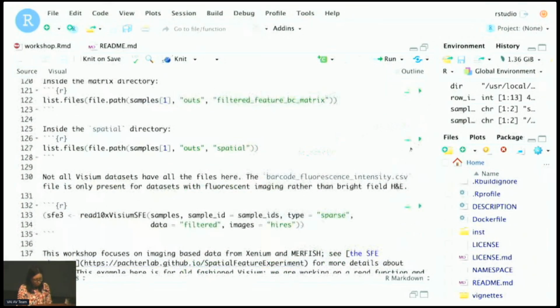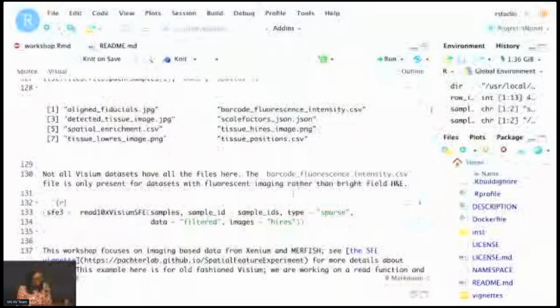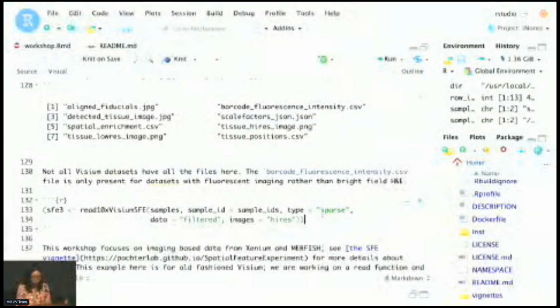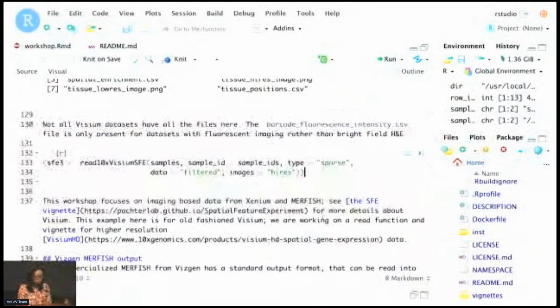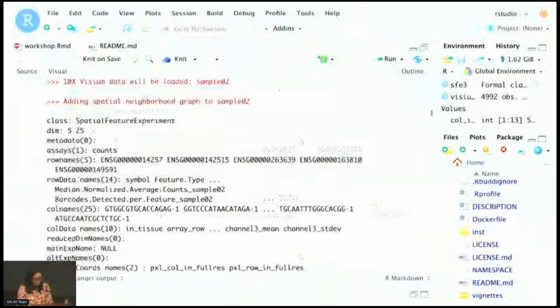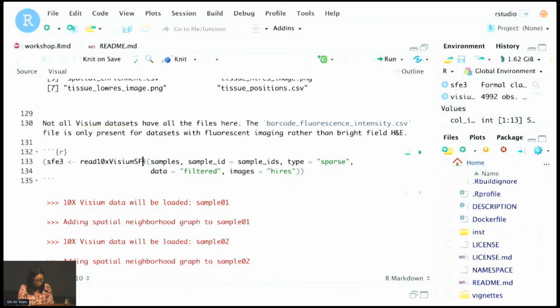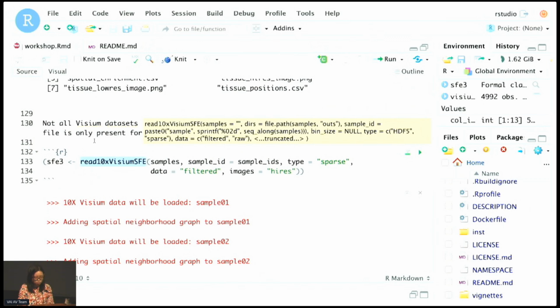But because the example data sets we're using in this workshop are from imaging-based technologies, that's where most of the updates in my packages are about, I'll just gloss over the Visium part. So basically, you use the read10xVisiumSFE function to read the output from Space Ranger. So this will read the output as a spatial feature experiment object.